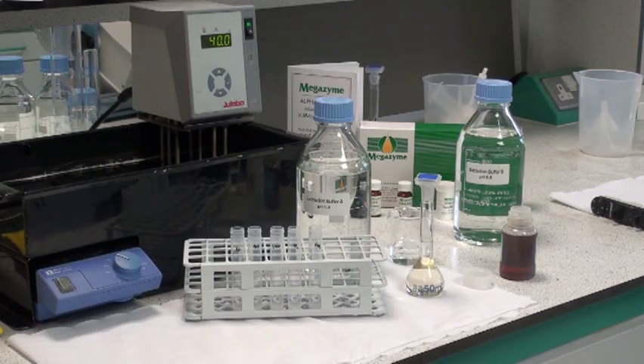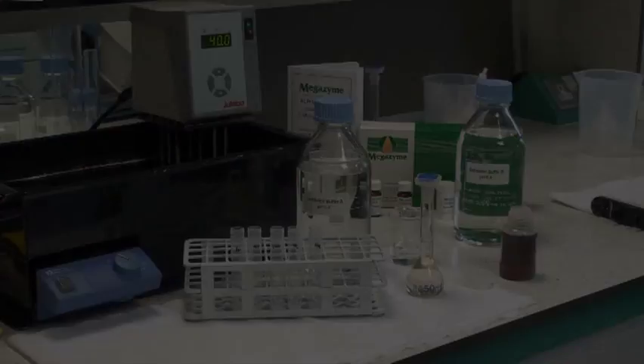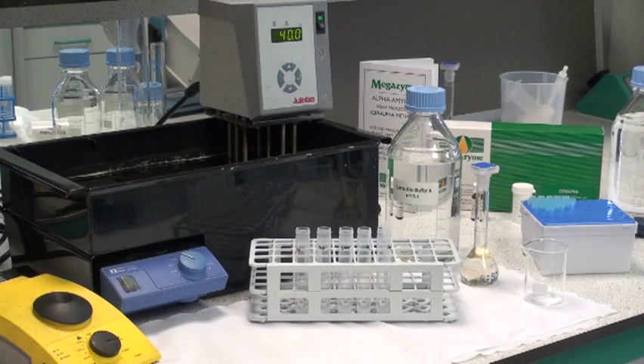For powdered microbial preparations, add 1g of the preparation to 50ml of the buffer. Stir well to allow the enzyme to dissolve and then filter the preparation for further dilution. Microbial preparations usually contain high concentrations of enzyme activity, so it's important to dilute this enzyme to get the enzyme activity on scale for the assay. This will be demonstrated now.